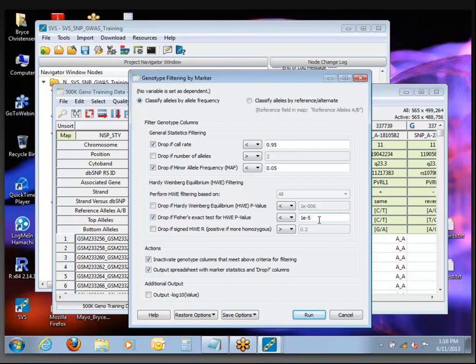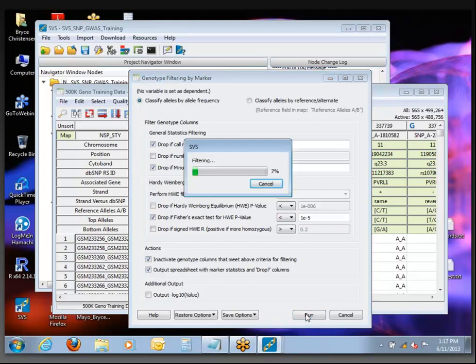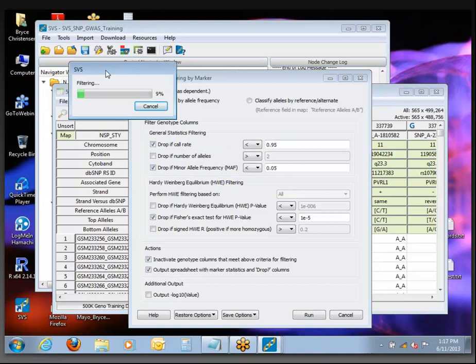Has everybody got their values entered so it looks kind of like mine? I'll go ahead and click Run, and it should go relatively quickly. The one thing in this dialog that's going to take time is this Fisher's exact test for Hardy-Weinberg equilibrium — it's quite a bit slower than the first option, just more computationally intensive.